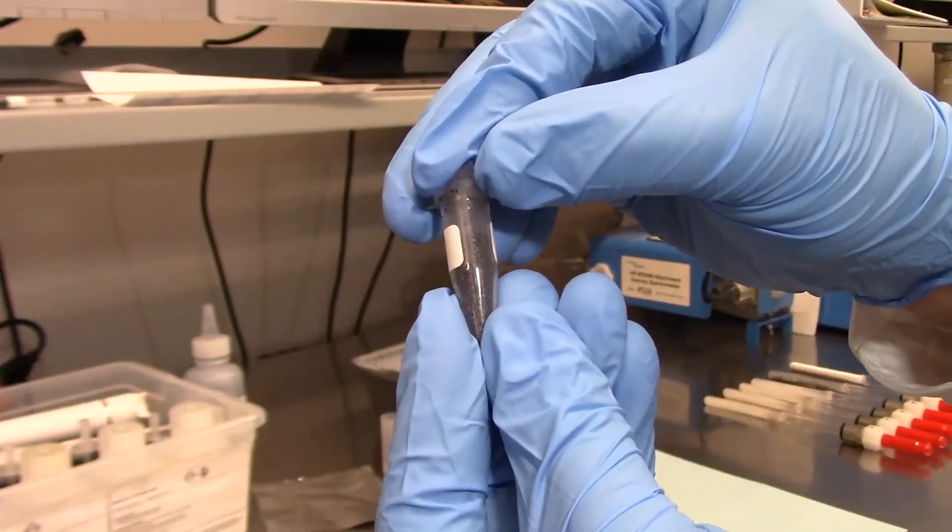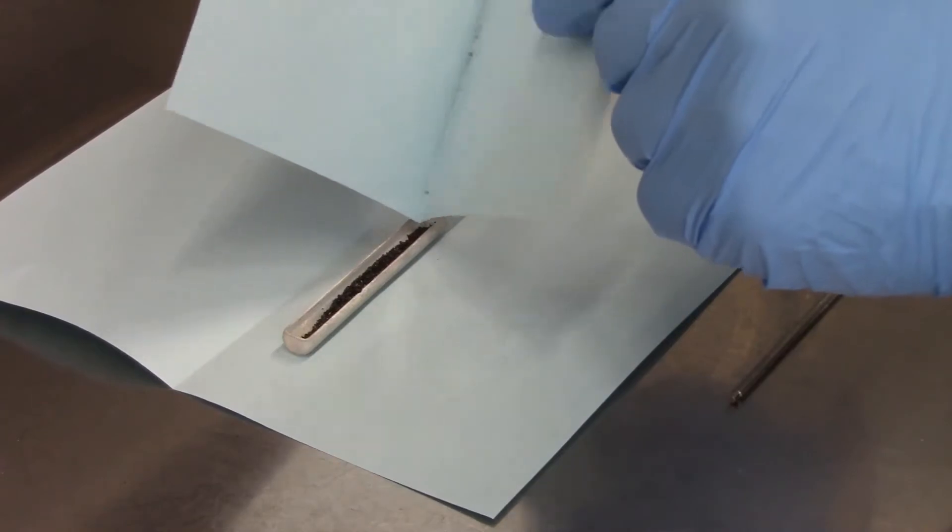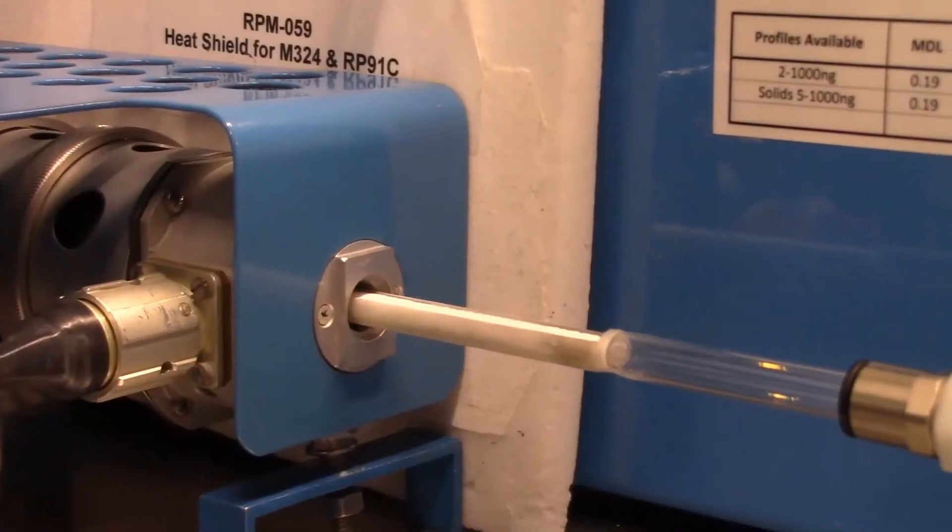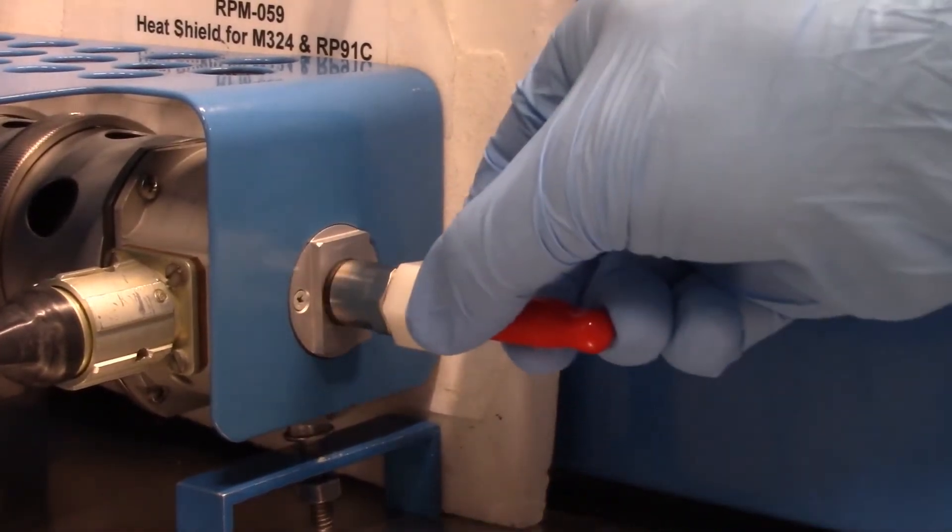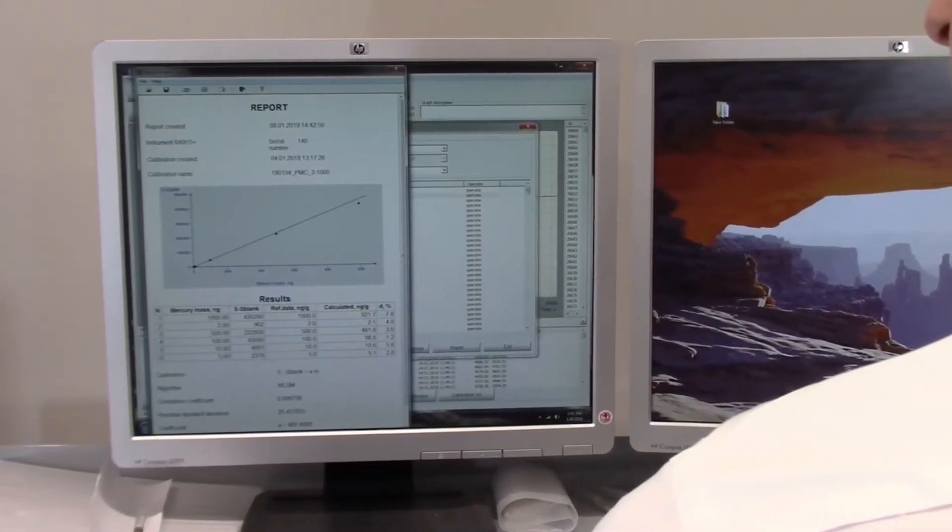It's easy! Simply open a vial of dry standard, pour it into the ladle, cover it with sodium carbonate, and insert the standard in the analyzer. Repeat this for every calibration point, then calculate your calibration curve.